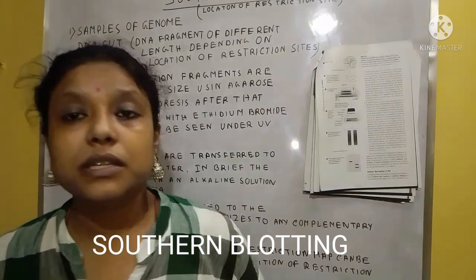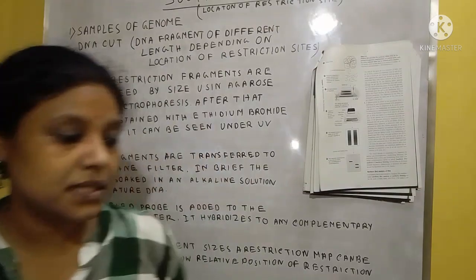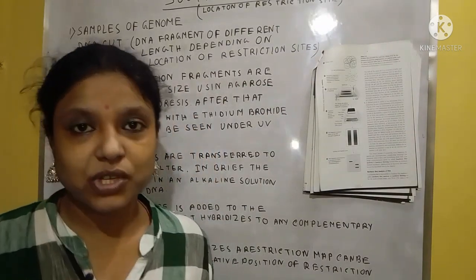Today I come with another topic. This is the Southern blot analysis. What is the Southern blot analysis? Southern blot analysis is actually a process where we can identify or recognize the DNA fragments with proper restriction sites.